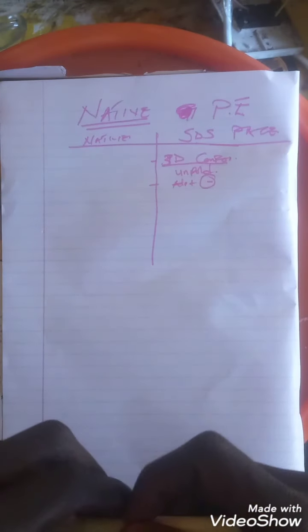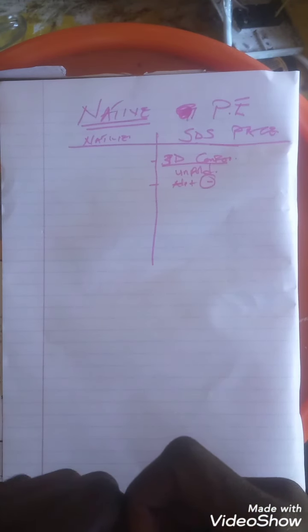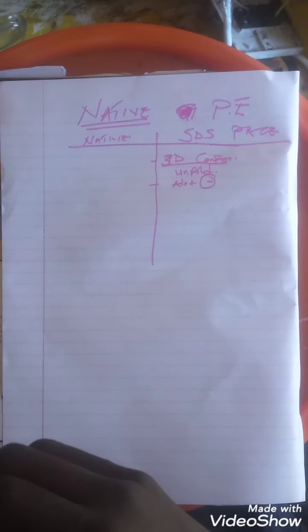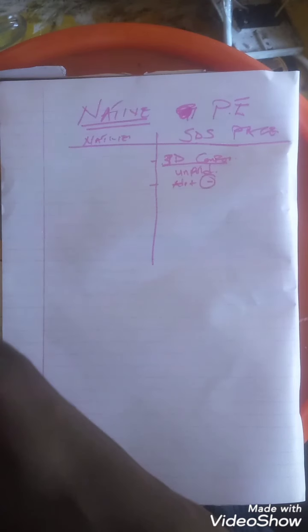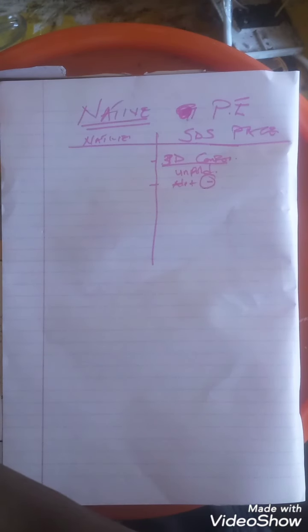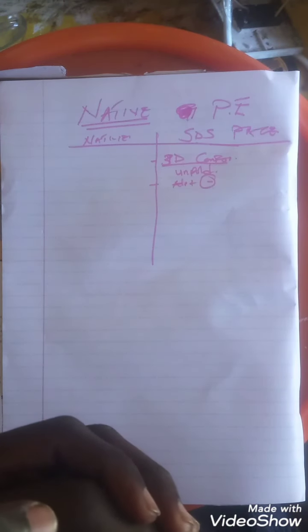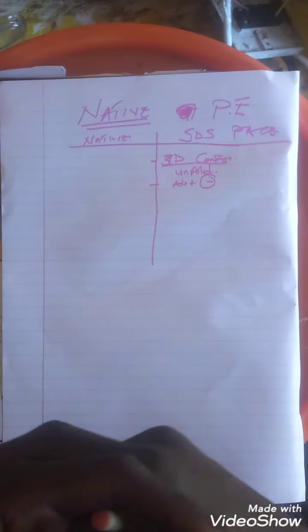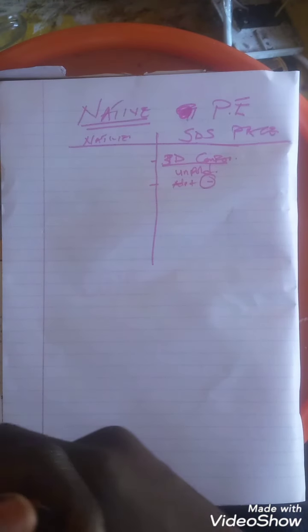So let us start with native protein electrophoresis. To understand this, we would have to at least remember a few things on SDS page. Why is it so? It is because SDS page also involves the separation of proteins. So that's why we will look at that a bit.